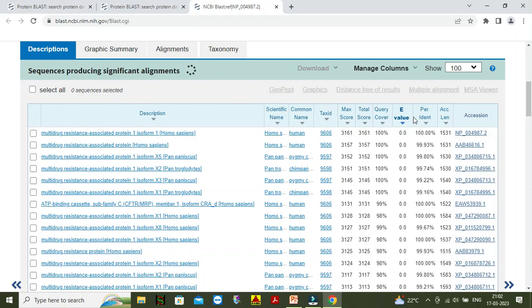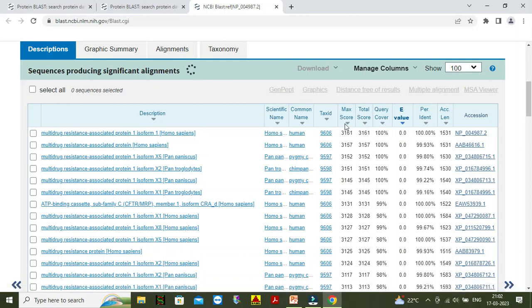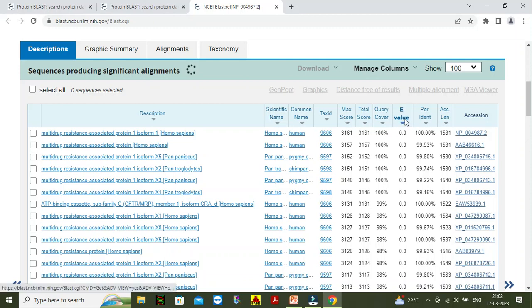In this section, this is the maximum score. What is the maximum score? Maximum score is the highest alignment score — or we can say this is the bit score — between the query sequence and the database segment. It is inversely proportional to the E value. Maximum score is inversely proportional to the E value.